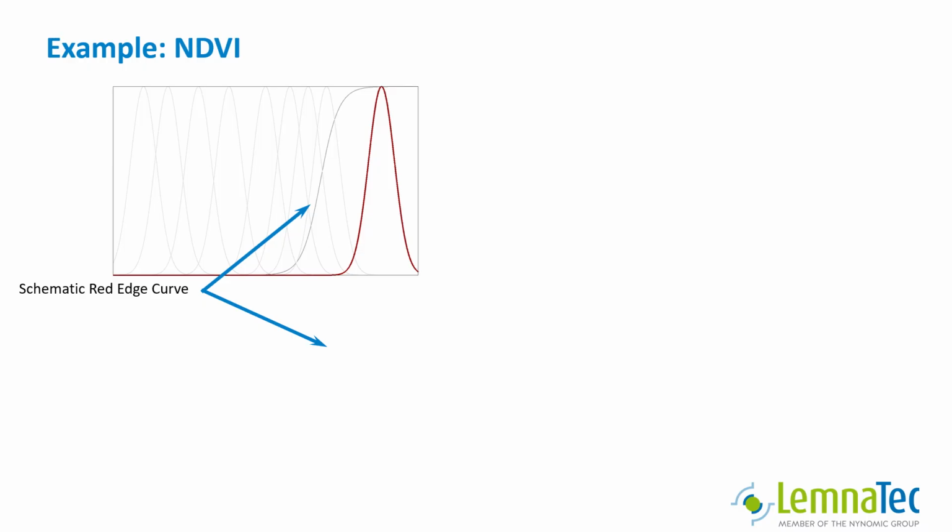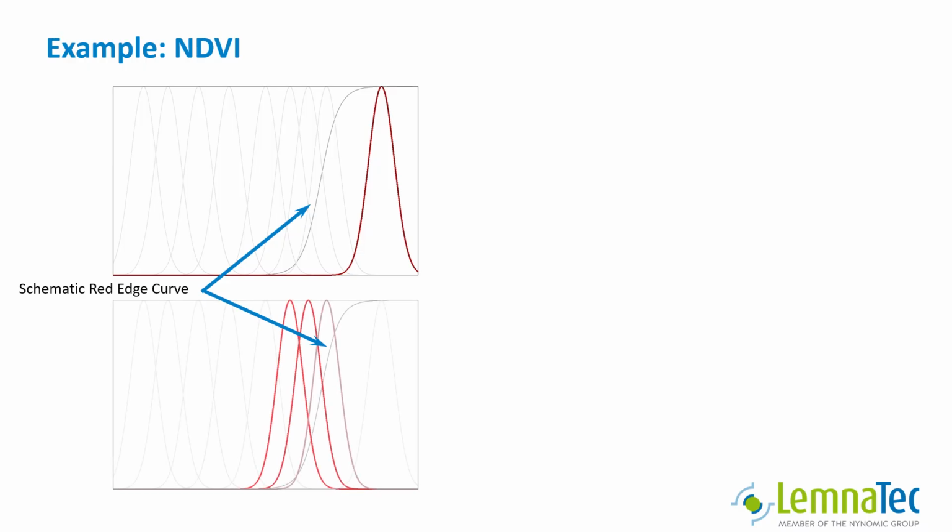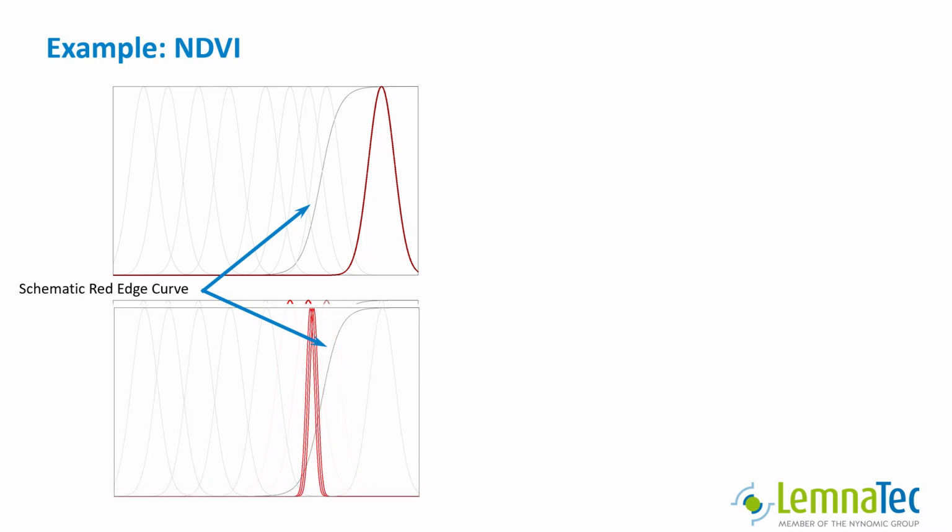Let's have a look into some examples of multispectral image analysis in more detail. The first example I would like to address is the NDVI. In order to calculate the NDVI with multispectral data, we need two images. One using NIR light and the other using some of the red lights, red or deep red. You may improve the quality using a filter around 680 nanometers. If you're using this filter, the far red light might be used as well.